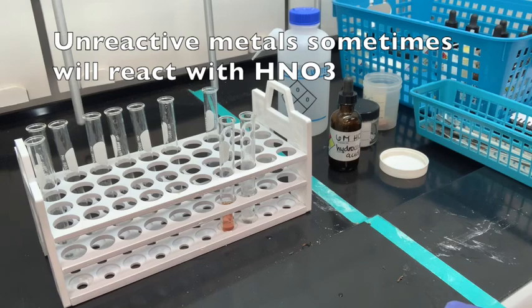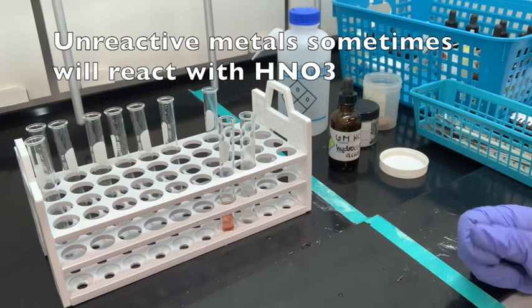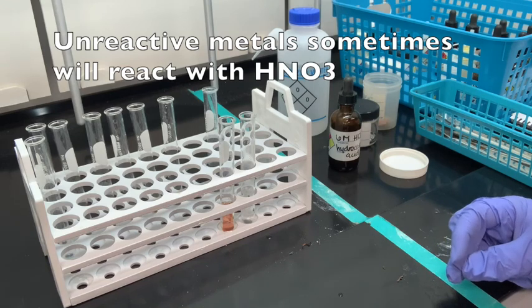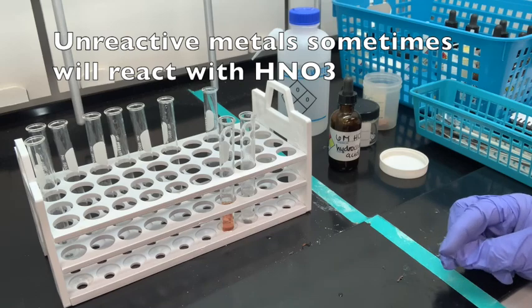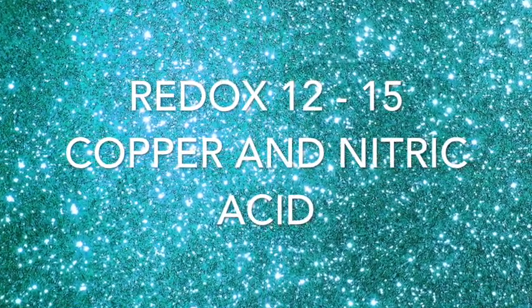Also, you want to know about unreactive metals. They might react with nitric acid. And in the next part, we're going to look at the reaction with copper and nitric acid. If you do have an unreactive metal that reacts with nitric acid, it's going to make some kind of oxide gas, some nitrogen oxide gas. So we'll look at that reaction in a minute, the reaction between copper and nitric acid.